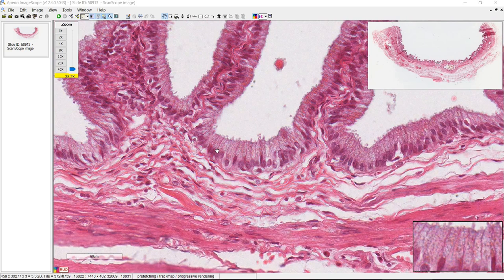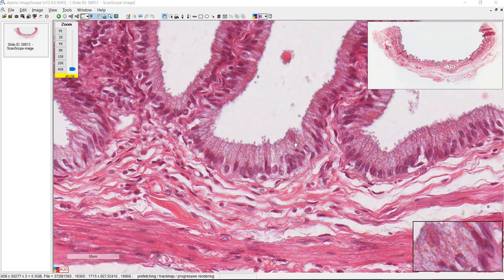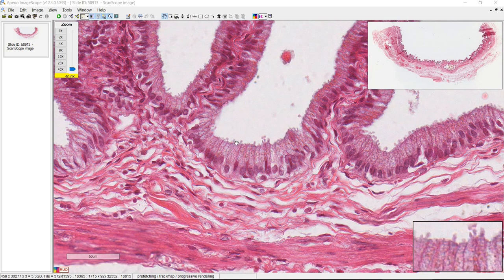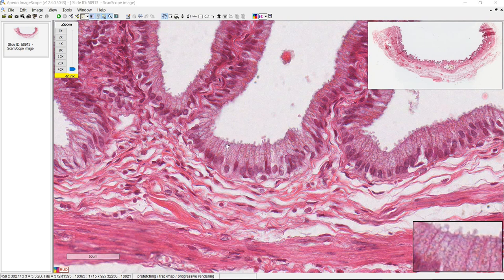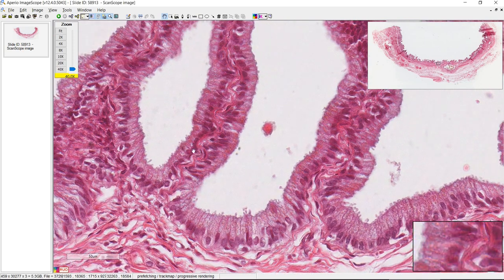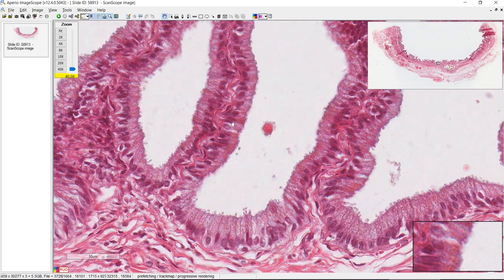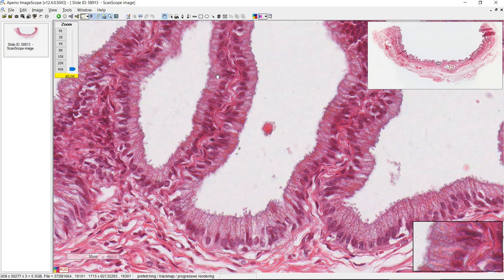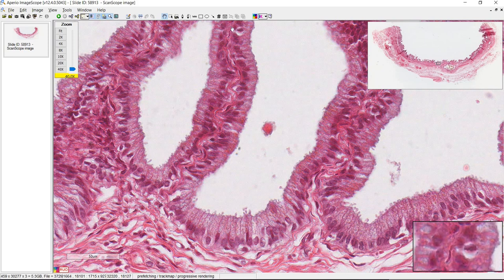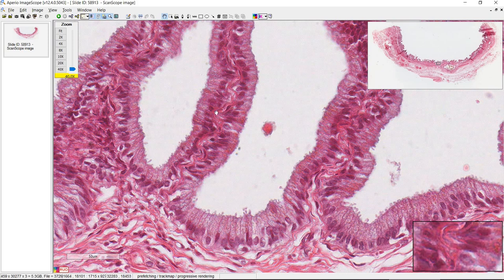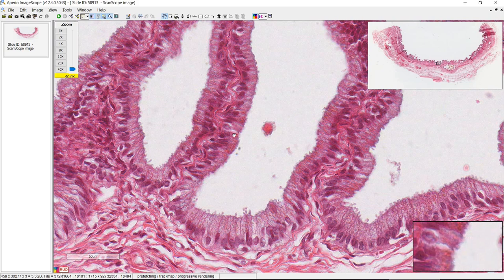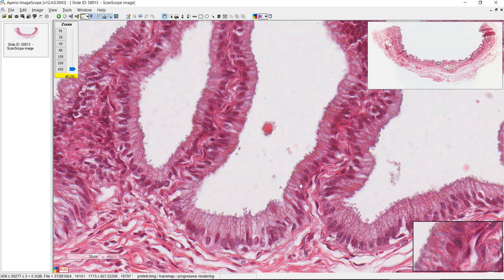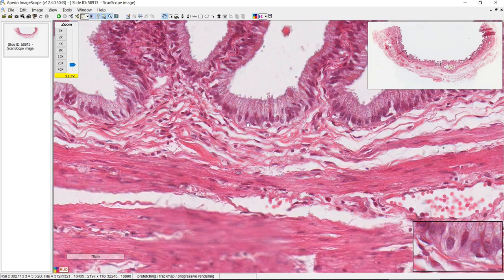On higher power, we have an epithelial layer of simple columnar cells. At the end of the cells, you can see some microvilli, but these projections are not villi — this is a mucosal fold. Remember that villi are only going to be in the small intestine. You can see a thin layer of lamina propria with epithelial cells on either side. There are no goblet cells here and no crypts, so we're definitely not in the intestine.